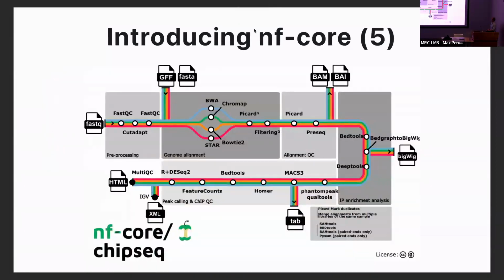Okay, so I just wanted to briefly give an overview of a pipeline. This is produced by NF Core, the consortium that produces these pipelines, and this is for ChIP-seq. What they do is produce these little tube maps to describe the data flow through the pipelines. So you can see you have your FASTQ file that comes in, then there's a bit of quality control and mapping. There's a few other steps around here. And then based on the mapped data, you do peak calling with MACS3.